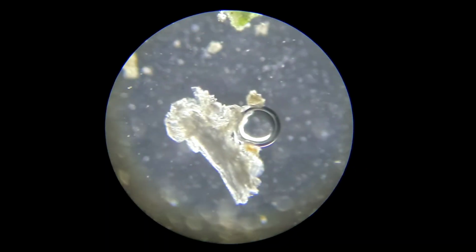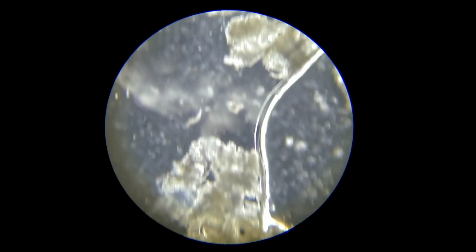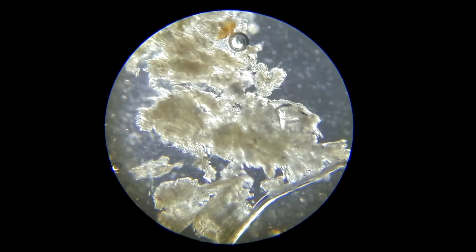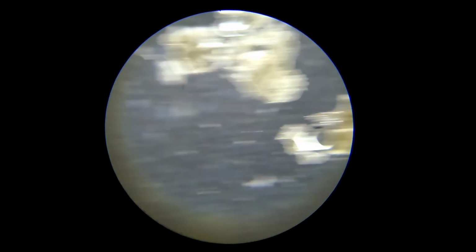This is the wax under the microscope. What you are seeing here are irregular wax particles, solid, uneven and non-moving. Microorganisms like bacteria or protozoa have defined shapes, membranes and often movement.